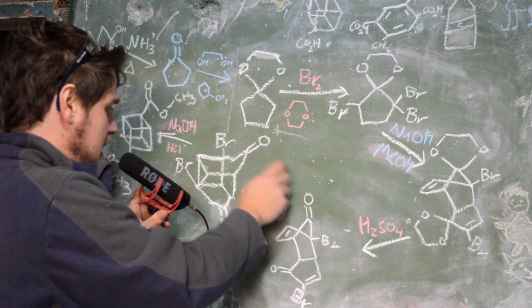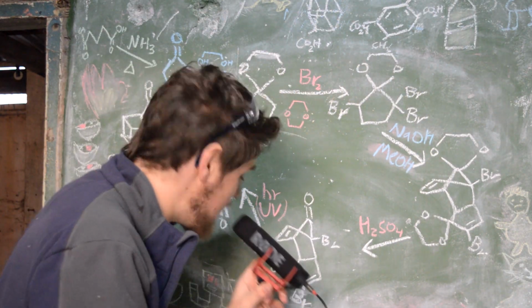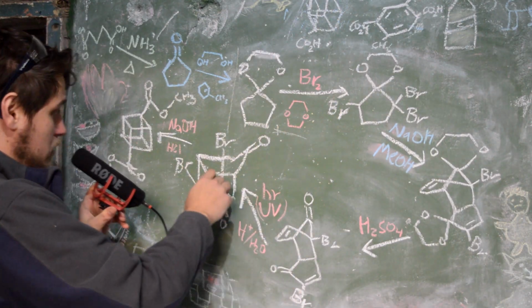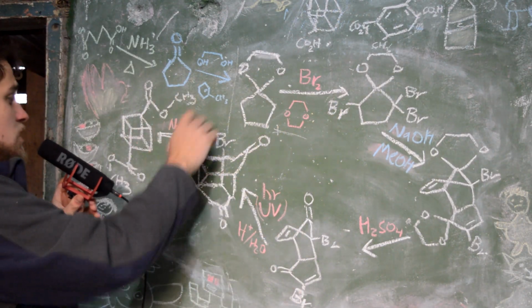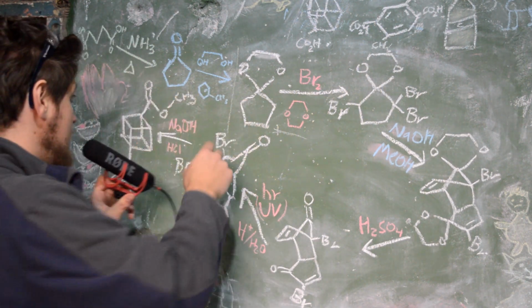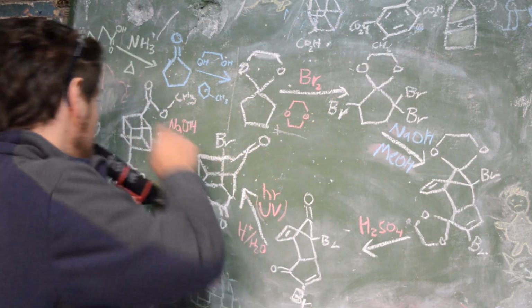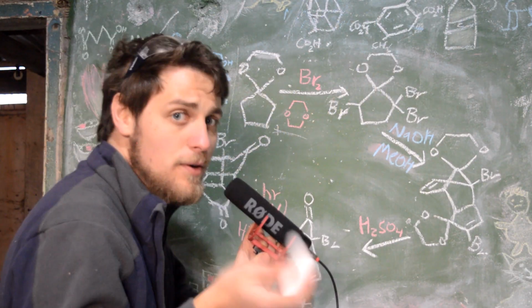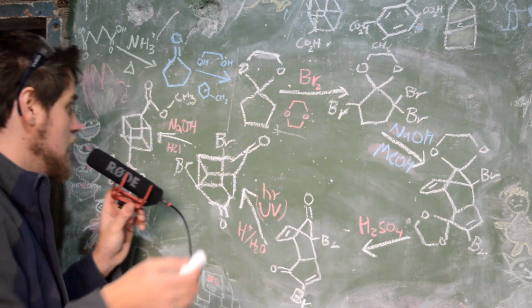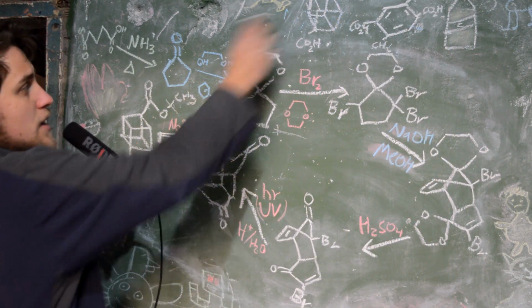And then what's interesting here is we've got a UV reaction. Now, I've never done a UV reaction. There have been quite a few requests for one. We do some photolysis here, to cyclize the molecule a little more and start forming a cube. And then they're just using sodium hydroxide and methanol and some acids, and they form the dimethyl ester of the carboxylate. They do that just for purification. Apparently this one's very easy to purify because they can purify it by sublimation. Once you've purified it, you can just cleave the ester groups and you've got your final product.